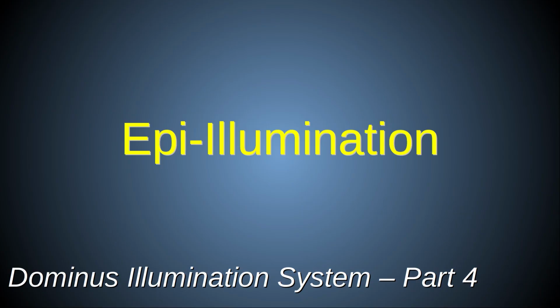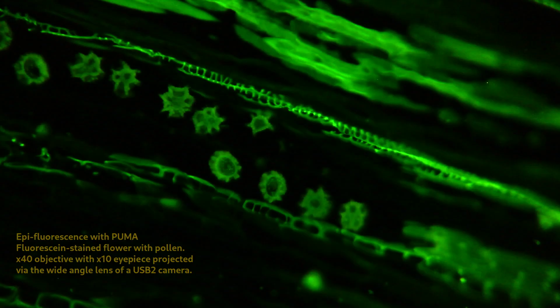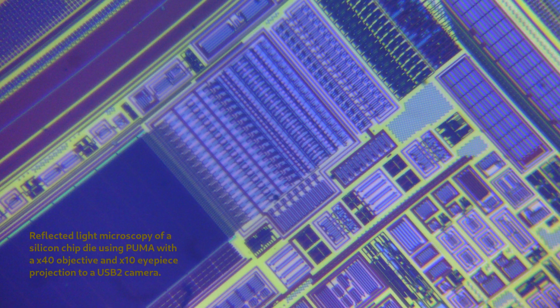In this video, I'll explain how to make the Epi-illuminator modules. These allow specialist modes of microscopy, such as Epi-fluorescence, and reflected light microscopy, such as that used for metallurgical analysis. There are many specific forms of Epi-illumination in microscopy.